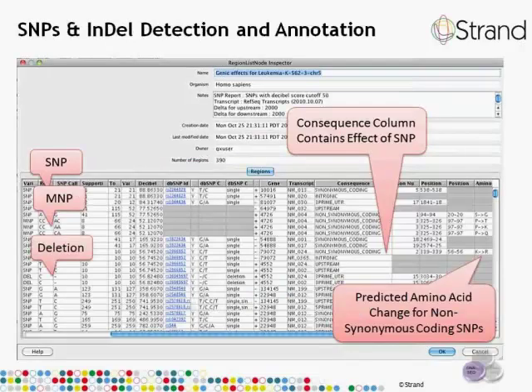After the filtering step, the SNP detection workflow step can be run, and a typical example of the result is shown here. The table shows a lot of information for each SNP that was detected. The first row shows a SNP for which there are 21 supporting reads from a total of 21 reads. This makes it a homozygous SNP. The next column shows that the SNP had a score of 89. A higher number for this score would provide more confidence that this SNP is real.